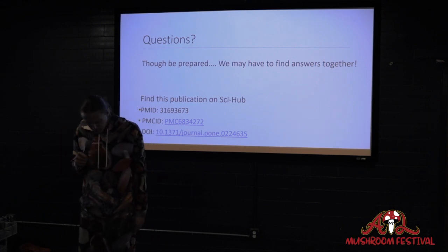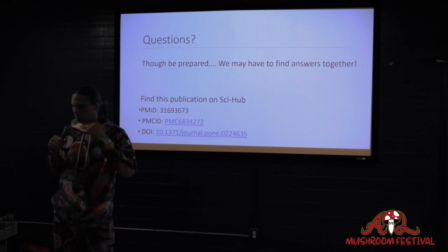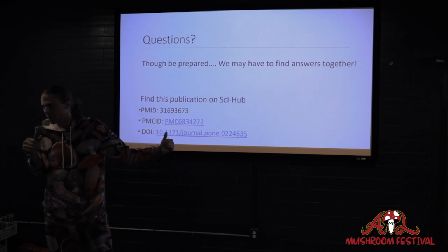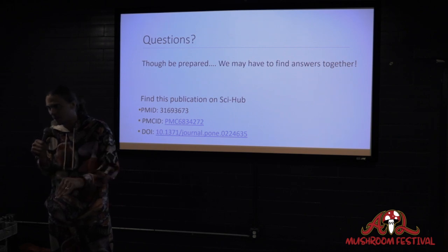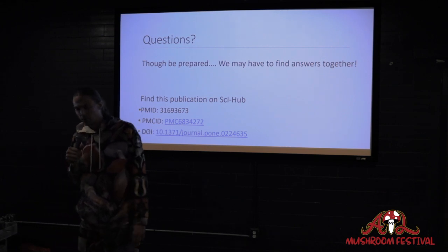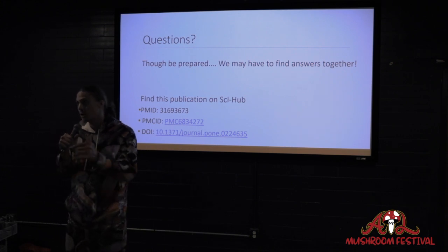And so some of those things, like cobweb might be, or other types that can triple their size within a day, this technique may not be effective for those specific things. But then again, your sample's pretty much dead if it's infected with that anyway. But at least for Aspergillus and Trichoderma, generally it takes about the same amount of time to peek through the agar that your culture does.